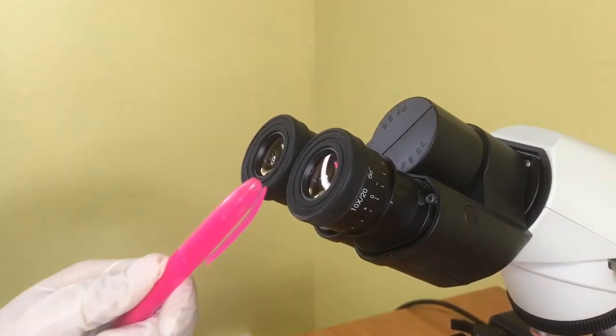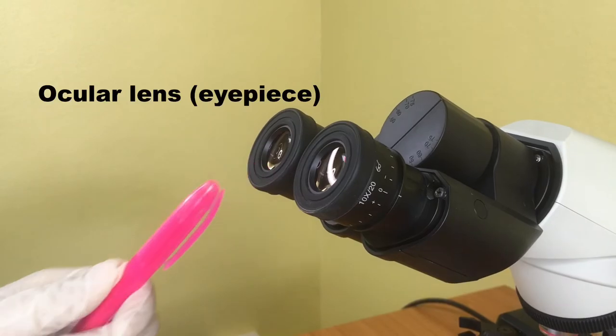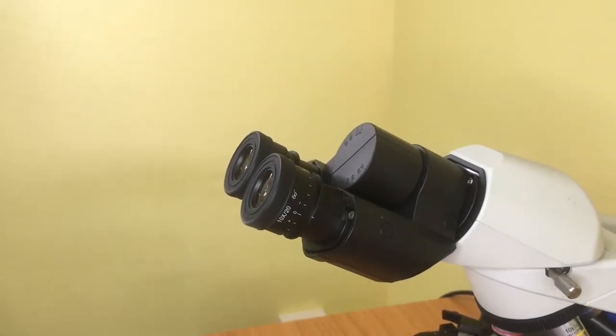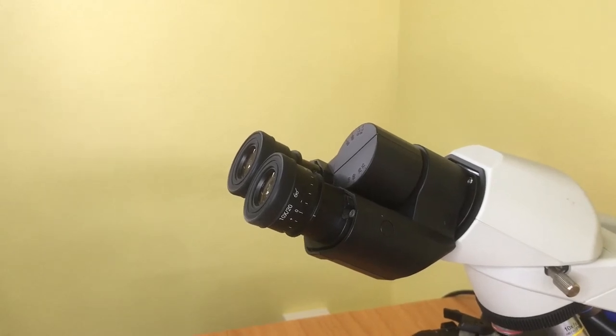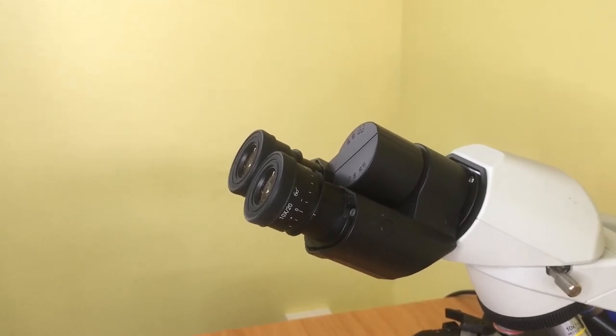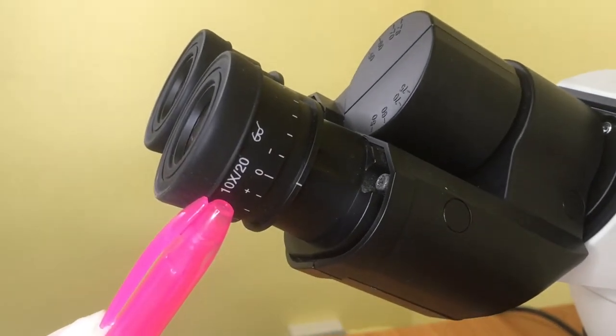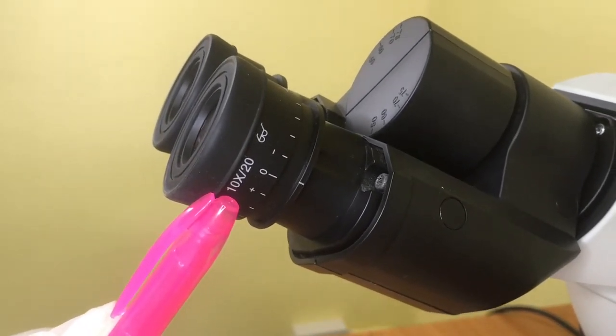Ocular lens or eyepiece. This part may contain lenses with 7-fold, 10-fold or 15-fold magnification. For the microscope used here, the ocular lens has the 10-fold magnification.